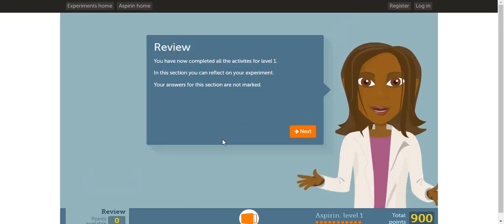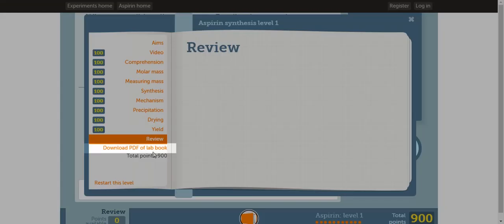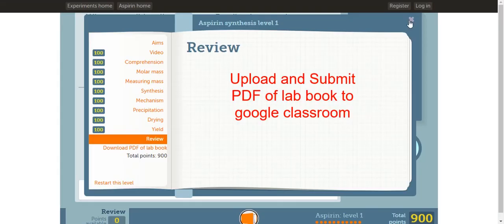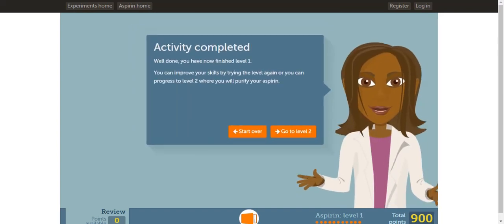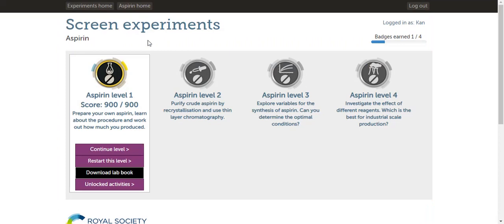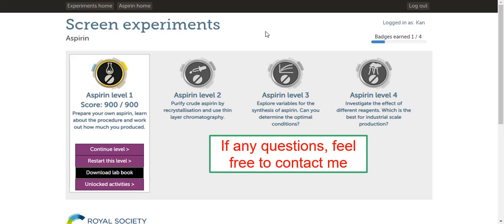Now we are about done with this virtual lab. Click next. Now you can provide feedback on how well you did. At this point, your virtual lab book is complete and you can download it. To download the virtual lab book, click this button on the bottom, then click download PDF of the lab book. The PDF you will submit through Google Classroom. If you click end activity, you can start over if you wish or you can go back to the home page by clicking Aspirin Home. At the home page, you can download the lab book if you wish. This concludes the video. If you have any questions, feel free to contact me.